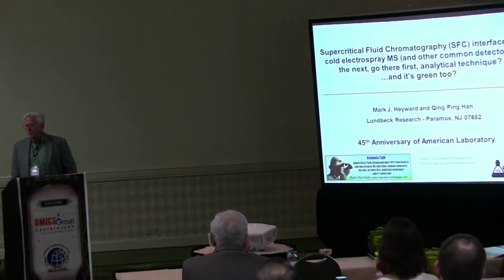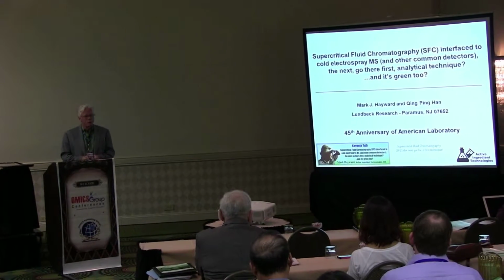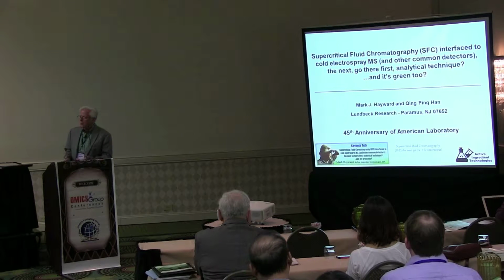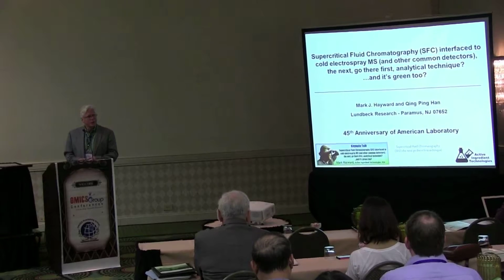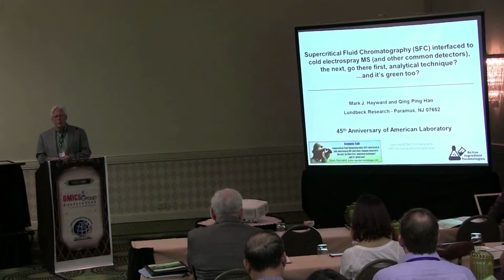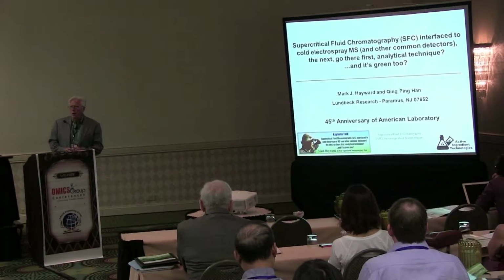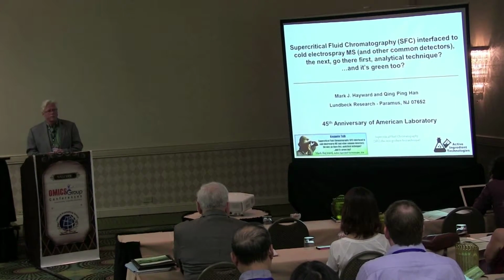So supercritical fluid chromatography has been around for a long time. And people that do it marvel at the fantastic separations you can achieve using this tool. But at the same time, it's always kind of been known for the detection part of it, detecting what comes out of the column, being a bit problematic, not as high quality as you would hope, and not as easy as you would hope.